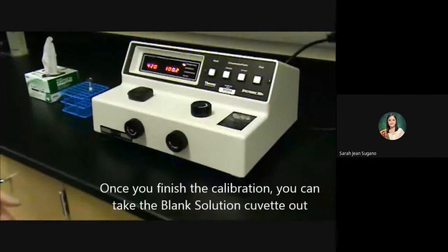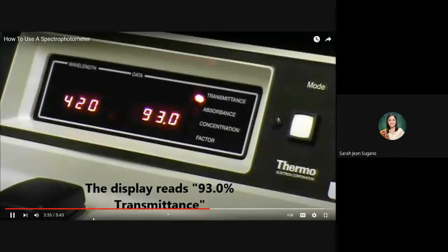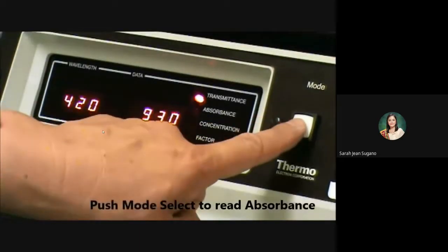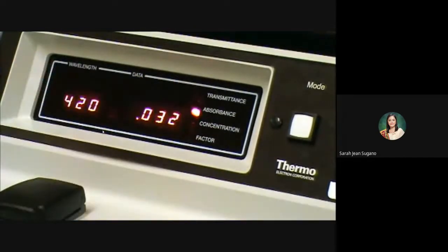Once you've set the machine at 100%, you can take your cuvette out and then put your sample in, again making sure that you line up the mark on the cuvette with the mark on the sample compartment. Here you can see that the transmittance value is 93.0%. You can also take an absorbance reading by pushing the mode button to go down to where it says absorbance. When the absorbance LED is lit, you can see that at the same wavelength, the absorbance is 0.032.